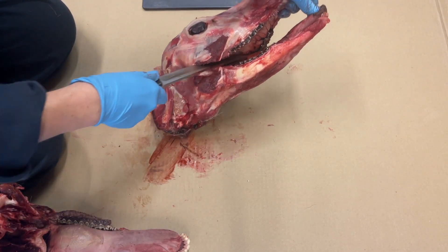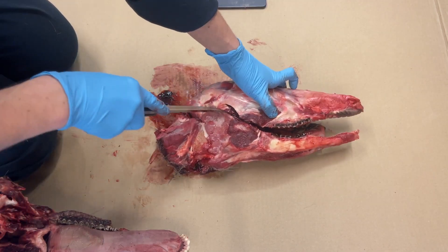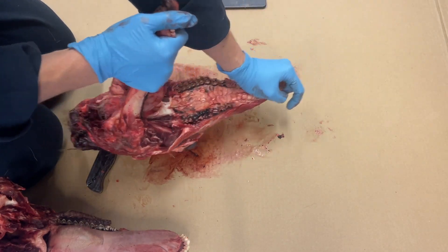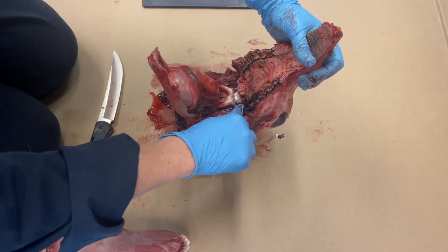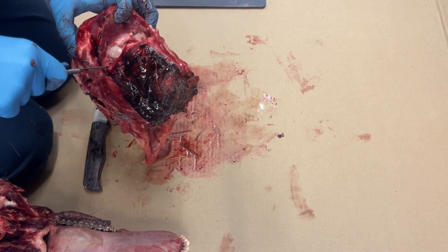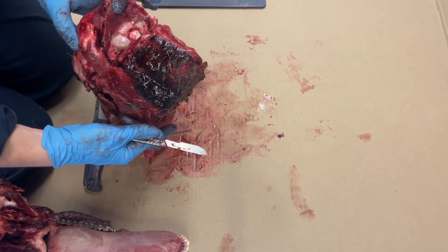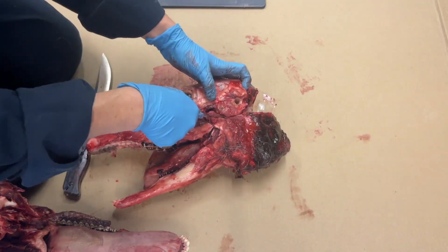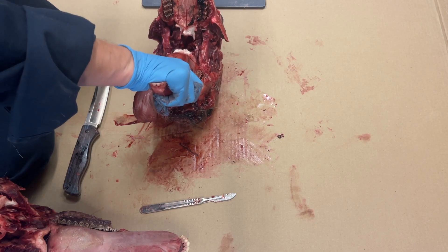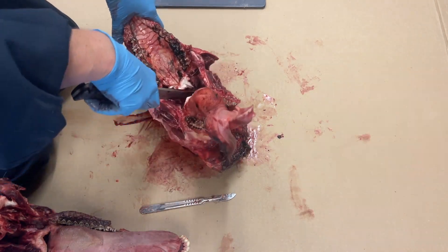Repeat on the other side of the jaw cutting along the arch. Continue to separate the muscle and fascia slowly until the bones begin to separate. You should be able to pull apart the lower jaw and the skull and start to cut the soft connective tissue in between. Eventually the arches of the lower jaw will pop out. Make sure to keep the soft tissue at the roof of the mouth and the back of the throat connected to the lower jaw.